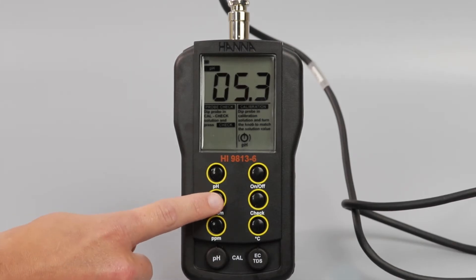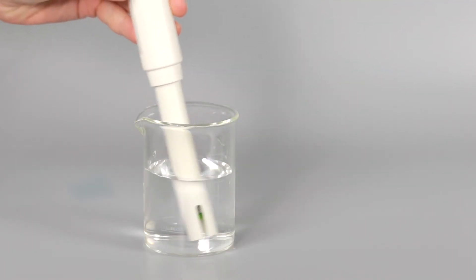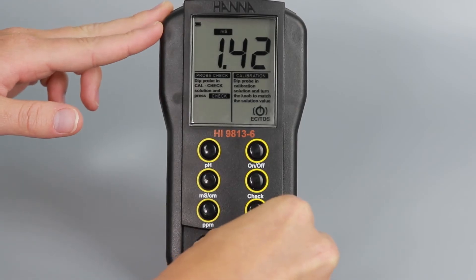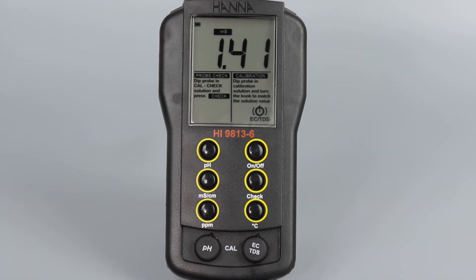You can also calibrate using PPM standards or EC standards. Press the millisiemens per centimeter or PPM button depending on which standard you have. Be sure the probe is clean and relatively dry, then rinse with some of your standard. Once primed, submerge the probe in some fresh calibration standard. Once the value is stable, turn the EC TDS calibration knob until the correct value is displayed on the meter.